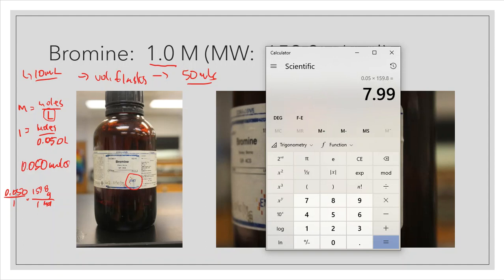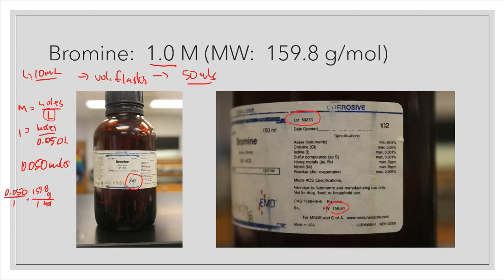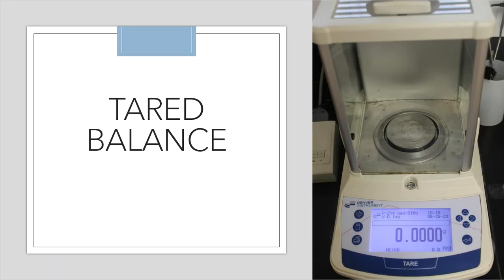So keep that number in your head, because later on when we take a look at some balance masses, we'll know where that number came from. All right, so I go to the balance now that I know how much that I need to weigh out. This is the amount of flour and sugar and eggs to make my cake, and my cake is trans-cinnamic acid here. I'm going to tare the balance out. All right, so taring the balance, all doors closed, everything shut.